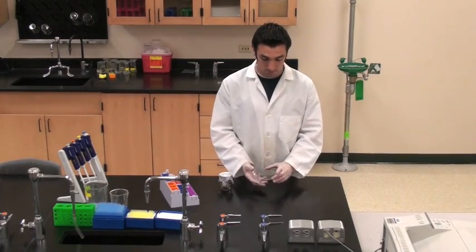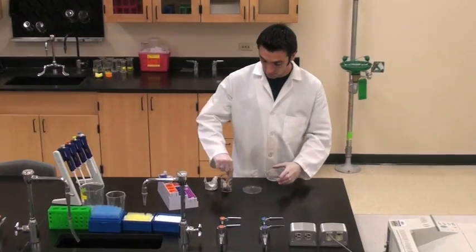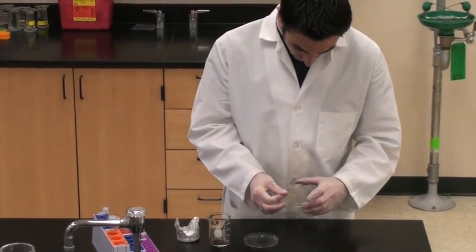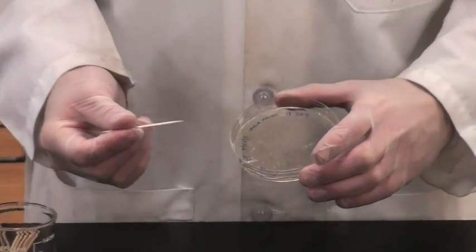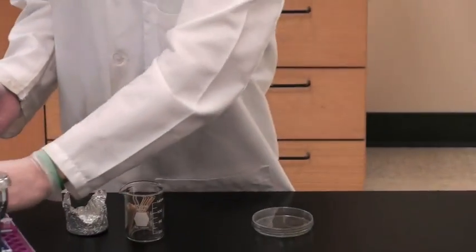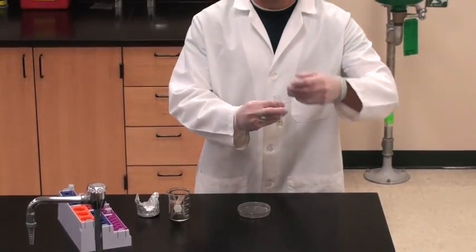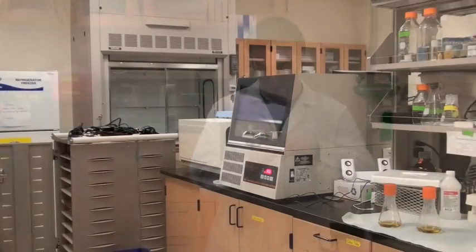The next part of the experiment requires precautions against contamination. This is avoided by wearing gloves. Use a sterile toothpick to touch a single colony and place the toothpick into an LB liquid culture tube. This transfers the bacteria to a liquid growth media, allowing easier, simpler extraction of the bacteria in the future.